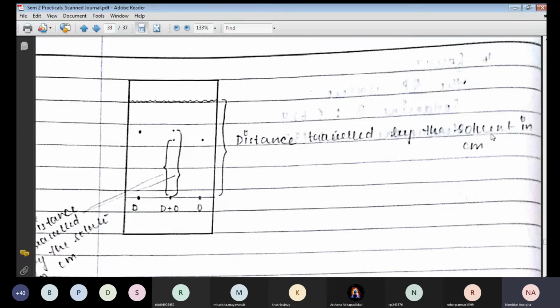Once it gets dried, in this particular case, both domperidone and omeprazole are colorless. Now the problem comes because they are colorless. So after separation we can just see small, colorless spots. Once it dries, वो spots भी चला गया because that is colorless, पानी जैसा होता है, तो वो भी नहीं दिखेगा once it is dried, right? So now in this case, you understand why standards are very important, right?